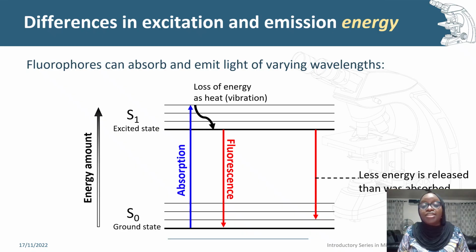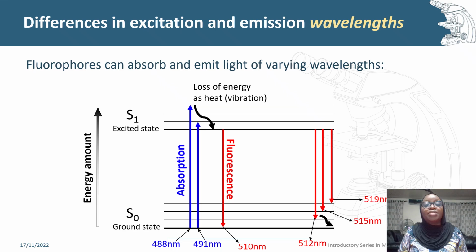So the energy released is less than the energy that was absorbed. As we see this, at the end of the day, the energy is lost as heat because of vibration.